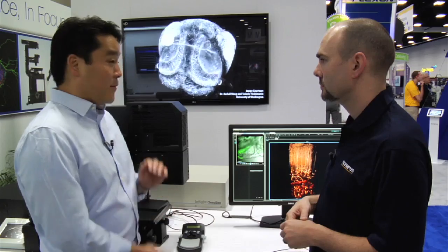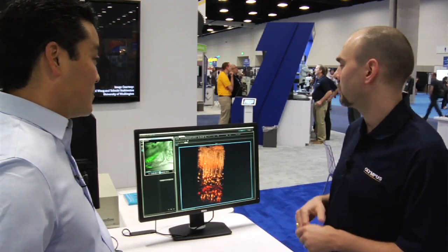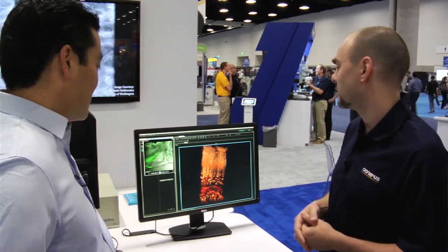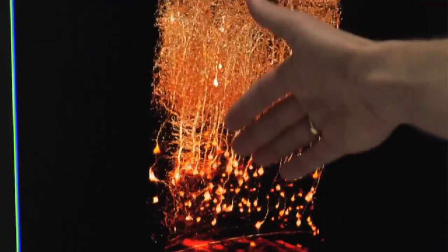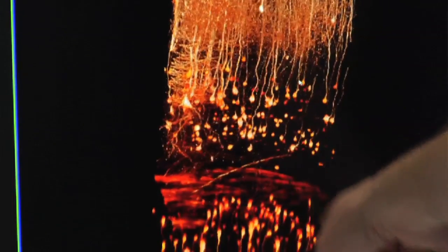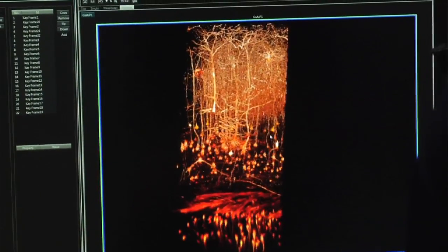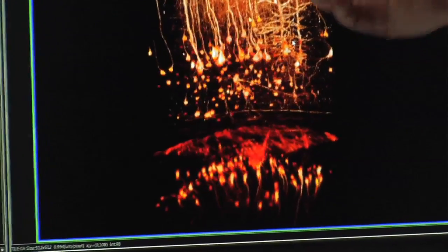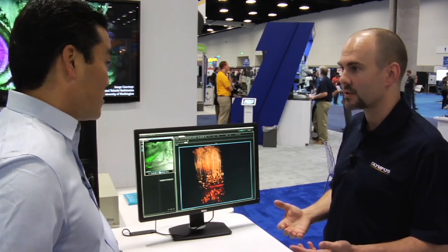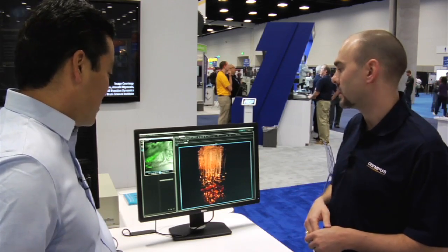I know you're also very proud about the depth of field that you can get and how deep into the tissue you can get. There are many things about this system that have been specialized and optimized — it's certainly one of the most sensitive systems I've ever seen. As we're looking at this data set here, we're imaging from the cortical surface of a living mouse all the way down into the CA1 region of the hippocampus. Many systems out there, you'd be happy if you got 500, 600, maybe even 800 microns into the brain tissue. But we're getting past the white fiber here in the corpus callosum and down into the cell bodies of the CA1 in the hippocampus — 1300 microns into the tissue. Imaging in the hippocampus has long been a goal of neuroscientists because it helps to understand questions about memory and learning. This kind of resolution and detail that far in is really extraordinary.